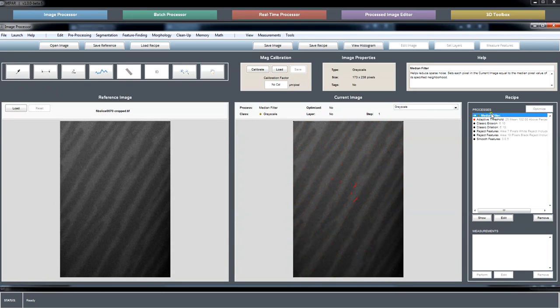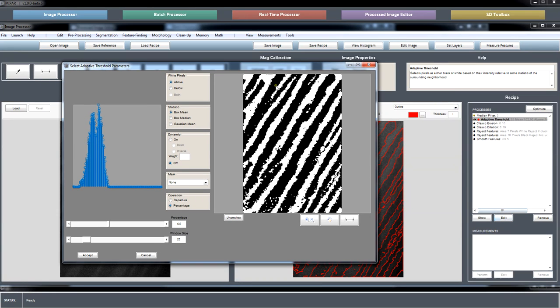This user was pretty pleased with this segmentation, so I'm using that as a point of measure. We first ran a median filter, and that did improve the noise somewhat. Then we went with an adaptive threshold step, which is usually one of those in most recipes. So I think I settled on this fairly manually, which is of course subjective.